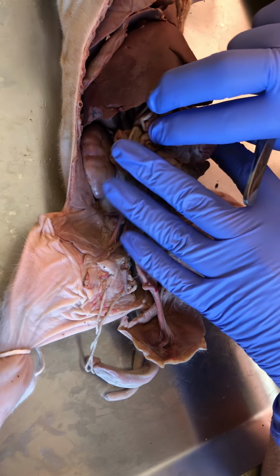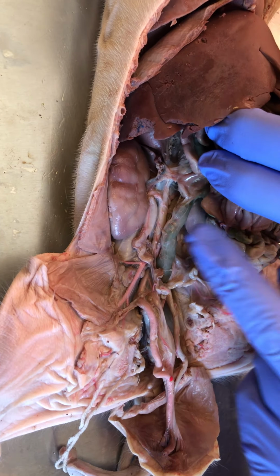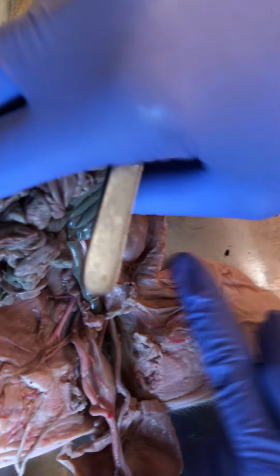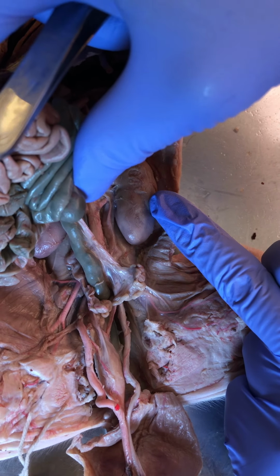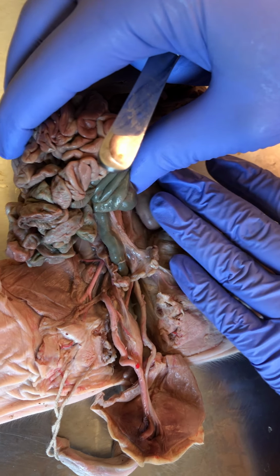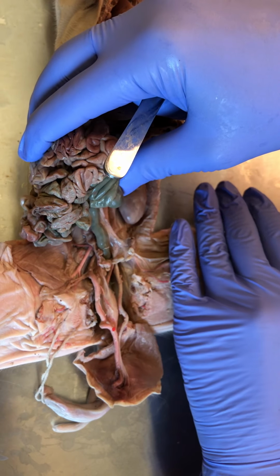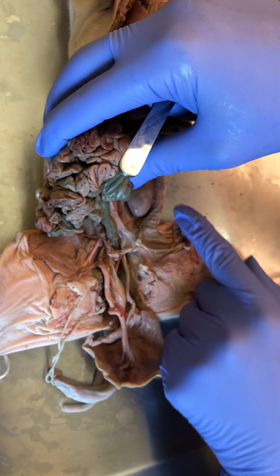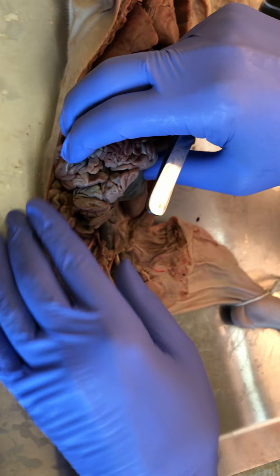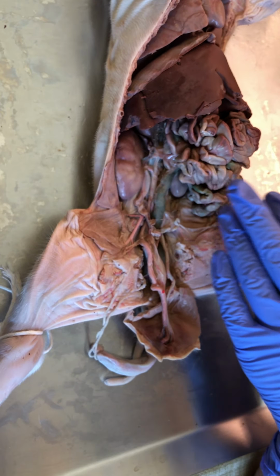A pair of kidneys. The workhorse of the excretory or urinary system is a pair of kidneys, one on each side. Notice just below the liver, so just posterior to the liver, one on each side. There you can see them both. The kidneys are retroperitoneal, that means they're behind the membrane, behind the coelomic cavity, so I actually had to break that membrane to expose them. They're pretty deep. We're just going to stay on this side so we're not rolling back and forth.